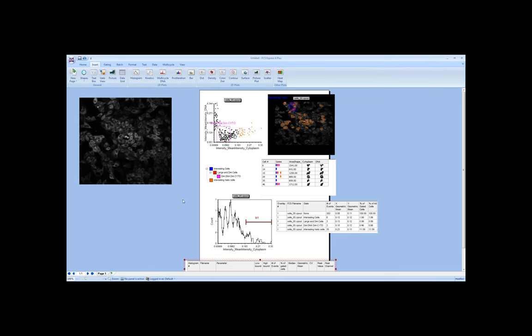I'm going to hand it over to Dragan so he can talk about how he's worked with all of these features to use FCS Express. But as I mentioned, we have many resources on our website.